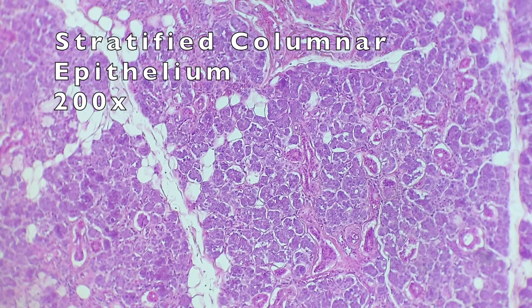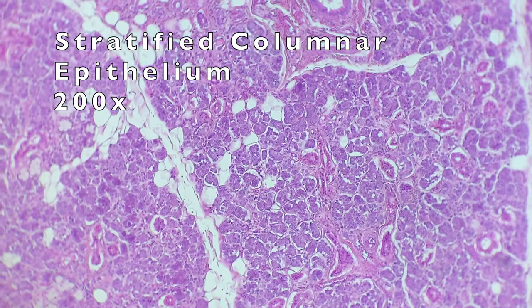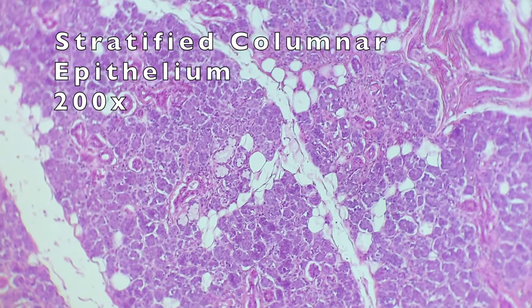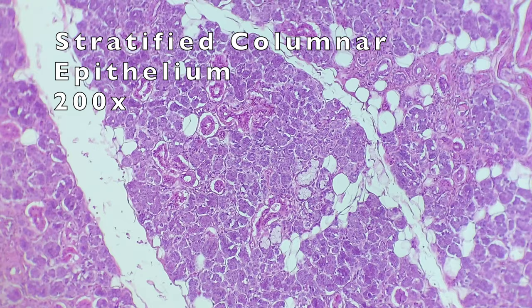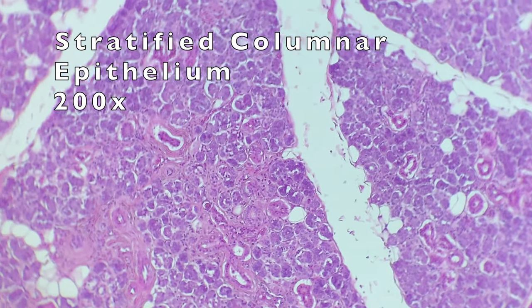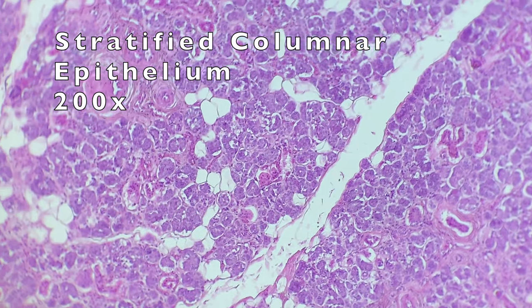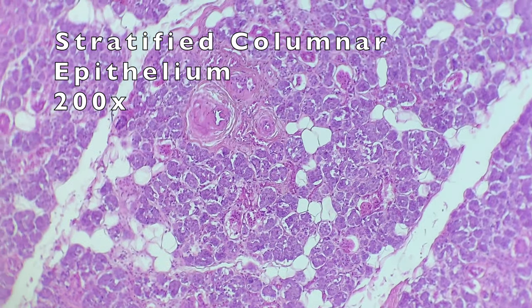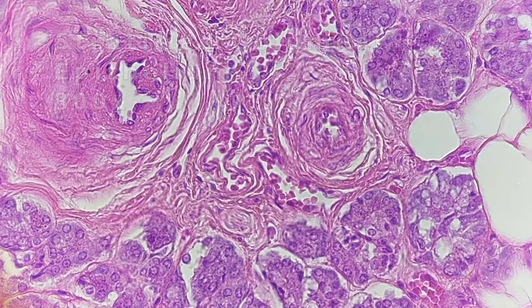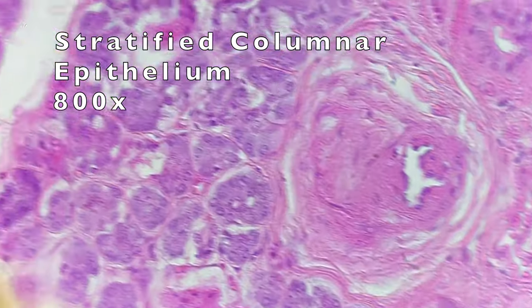It was hard to pick a spot where I should focus, but ultimately I decided to pick a region that was fairly dense with this purple tissue to take a closer look. Again, it's very hard to know exactly what we are looking at here. So let's just be quiet for a little while and appreciate the beauty of what we're seeing.